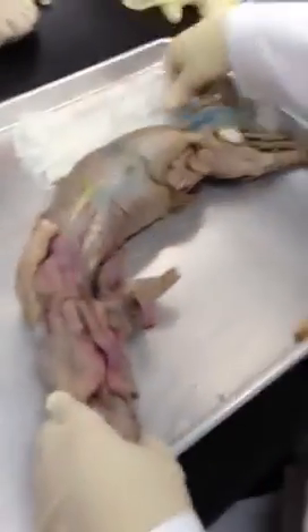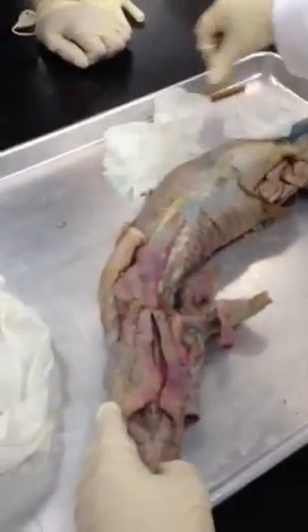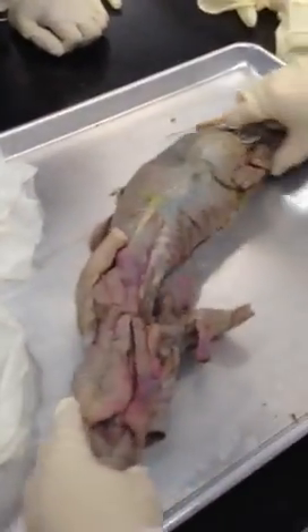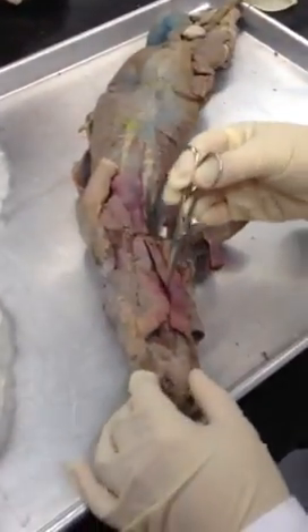So I can show you on my mink, just show you again how you can look at things a little differently. This may or may not help you for your practice tomorrow. From the front side here, this is my mink.